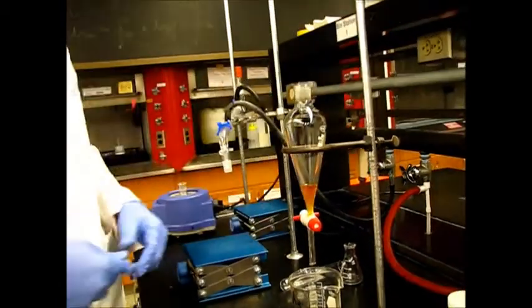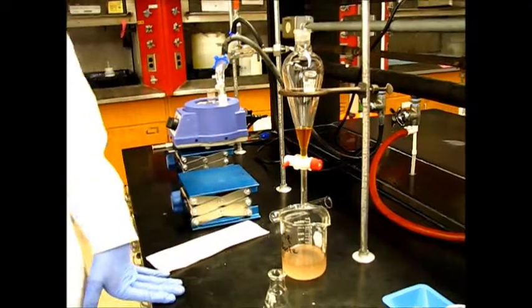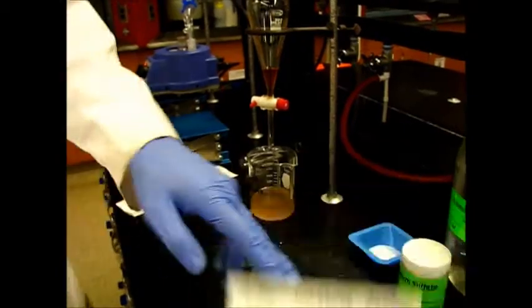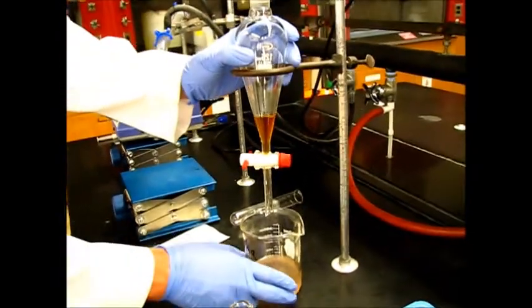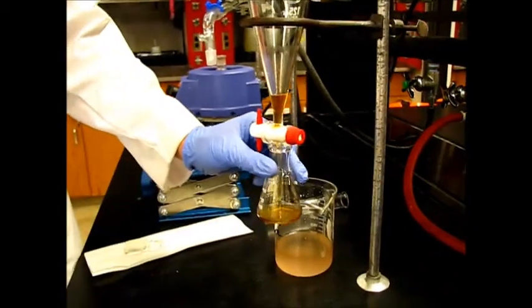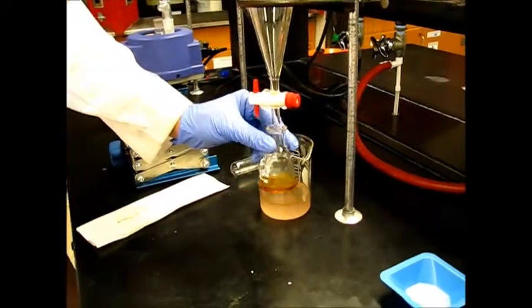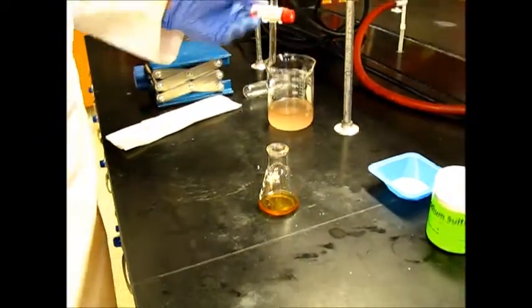To repeat the same thing. Yes, we're going to get another 25 mils of. So I just finished washing with sodium bicarbonate for the second time, and once with the saturated sodium chloride solution. So now this is our slightly cleaner product. What we're going to do is put it all into this 50 milliliter Erlenmeyer flask, and then dry it over anhydrous sodium sulfate to get any remaining water out of the solution.